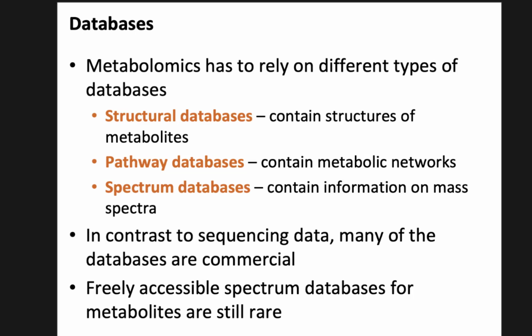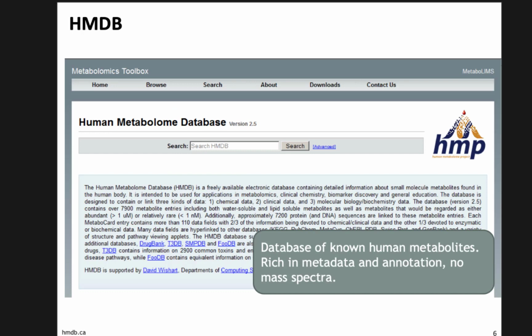In contrast to sequencing data, many of these databases are commercial, so you can buy spectrum databases from mass spec vendors or from other sources. Only recently, the community has started to make an effort to make more of these resources available. So let's look at some of them. They are all similar in a way.